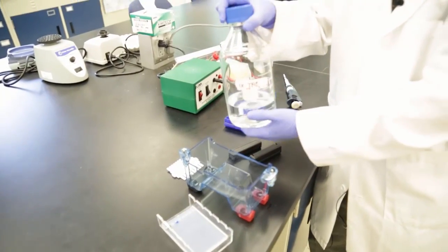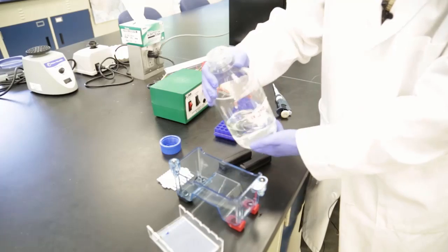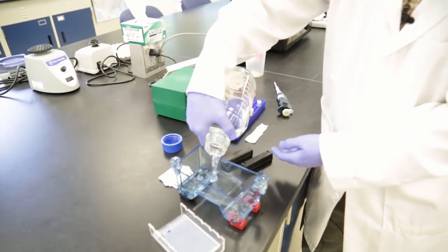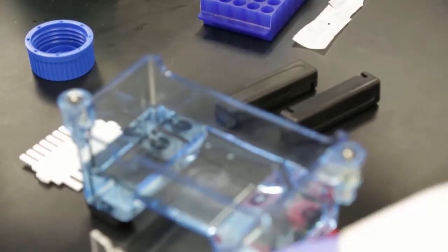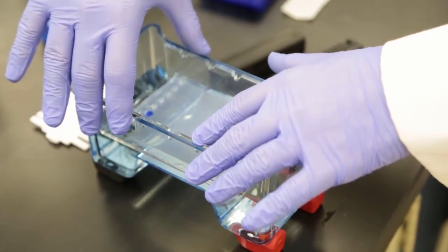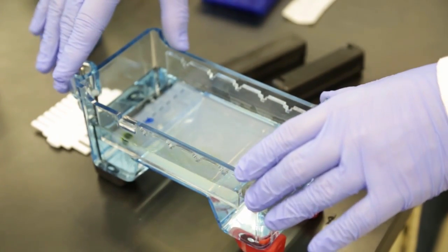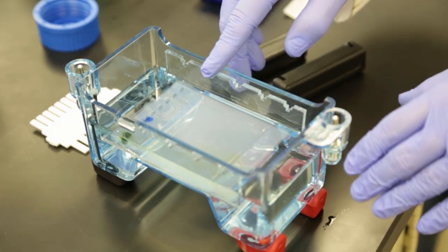I take my running buffer and I pour it into the gel box. I then take my gel and I slowly submerge it in. You want to make sure that there is enough running buffer to completely cover the gel.